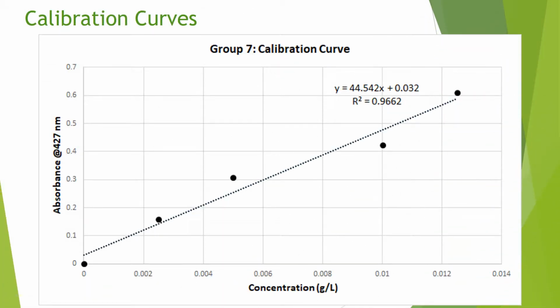The first thing that was done for the data analysis was to create the calibration curve that would be necessary for graphing the fraction of dye released as a function of time, and by extension, the theoretical model used to solve for n and k.